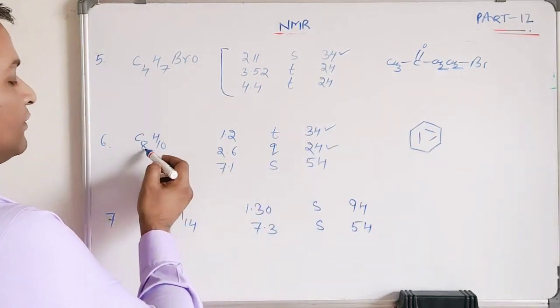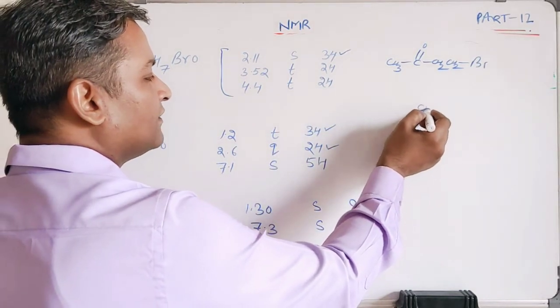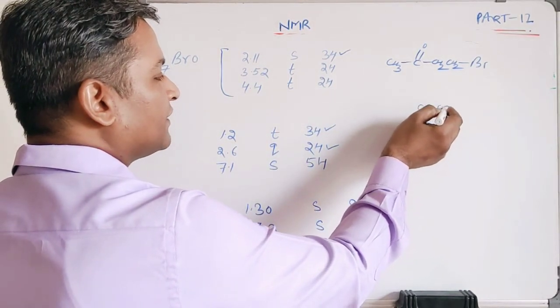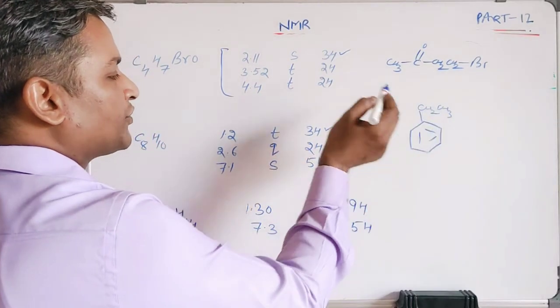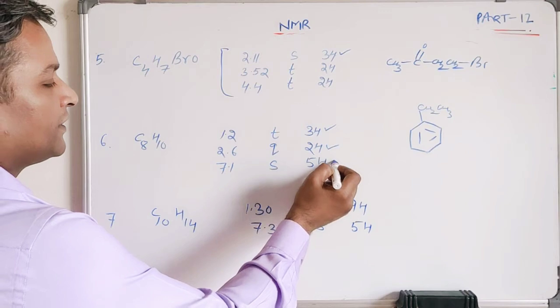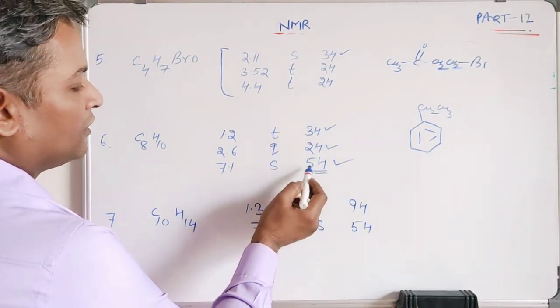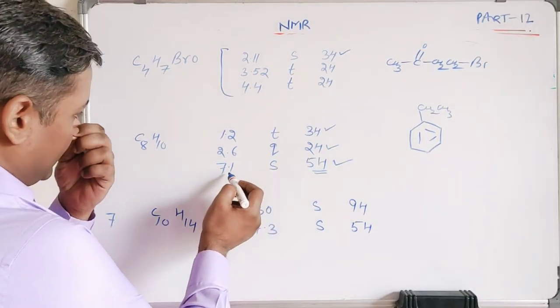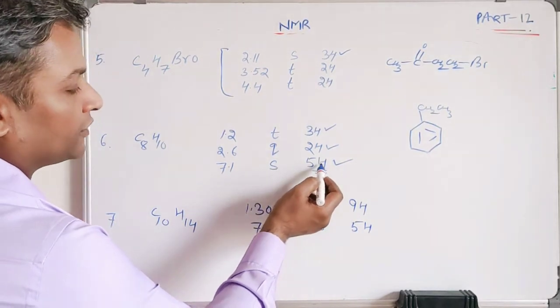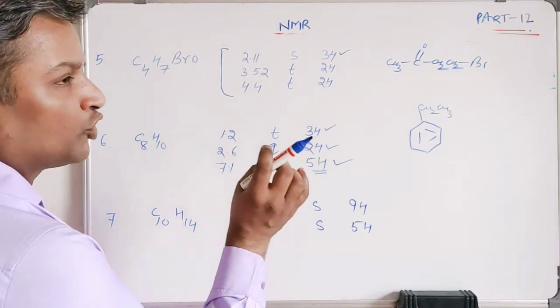We are left with 2 more carbons to count for. So if I write ethyl here, CH2, CH3, all 8 carbons will be justified. This is very important information. You should keep this in mind: singlet for 5 protons in the aromatic range always indicates monosubstitution.